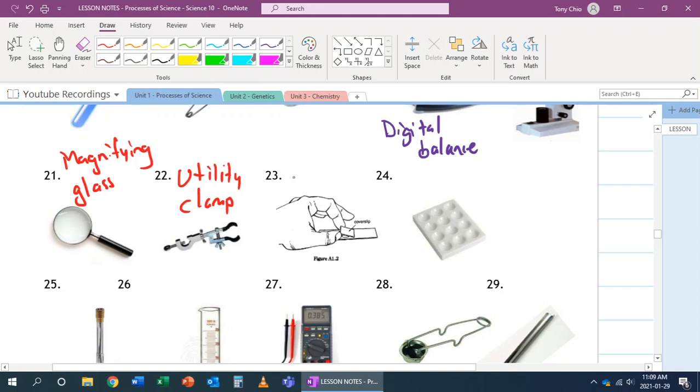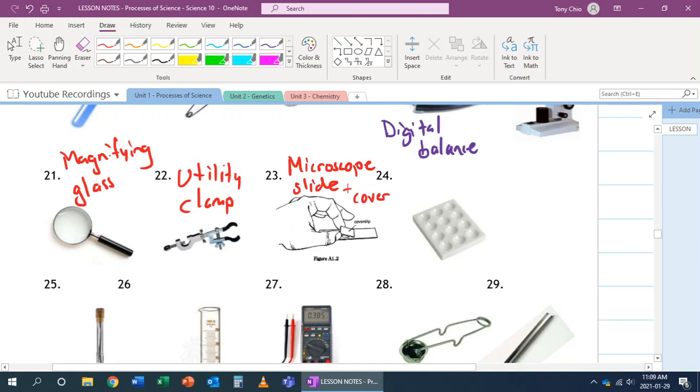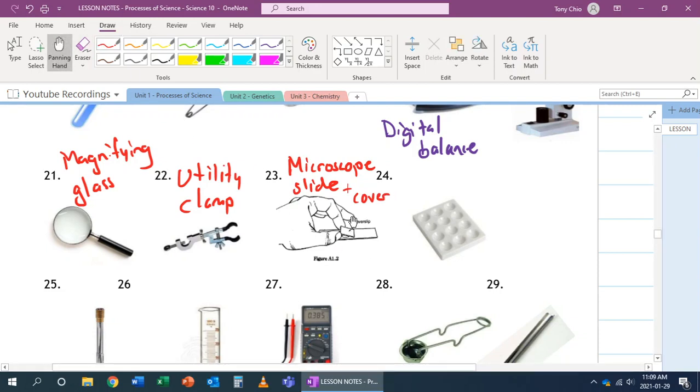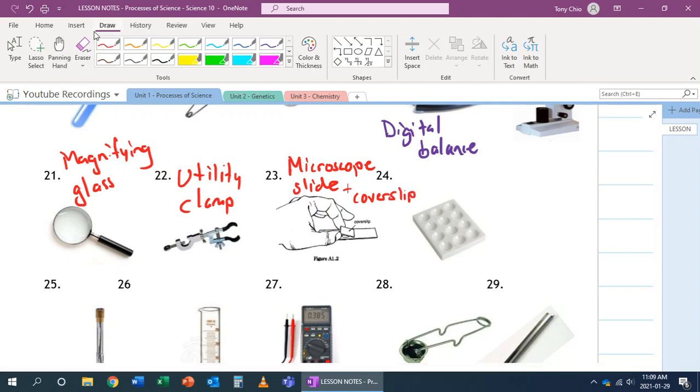Number 23 is called a microscope slide. And also, the little tiny piece on top, that's also called a cover. And it's where you can put a specimen on there, put the cover on it, the cover slip in this case, and thus, because of that, you can now look at this object through a microscope.